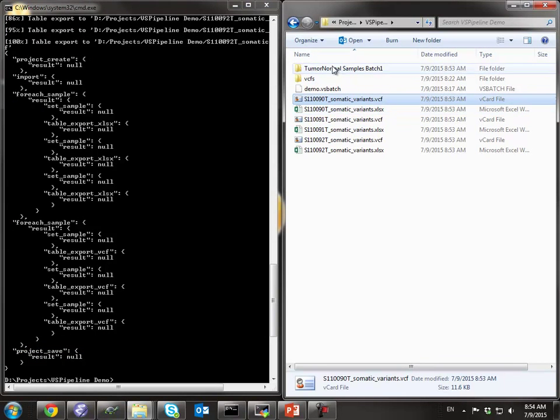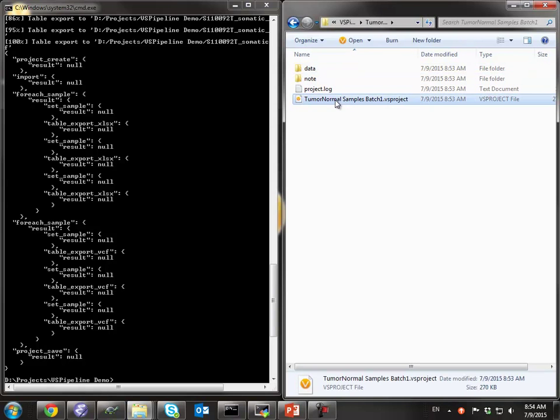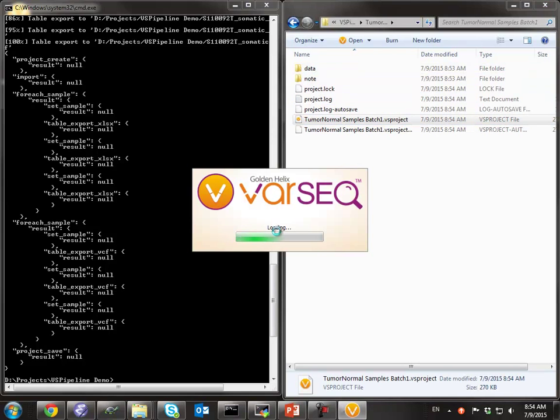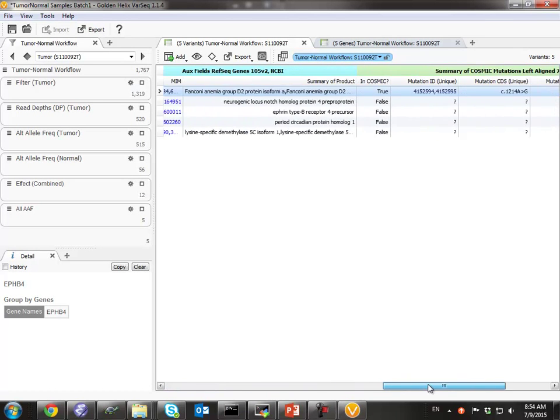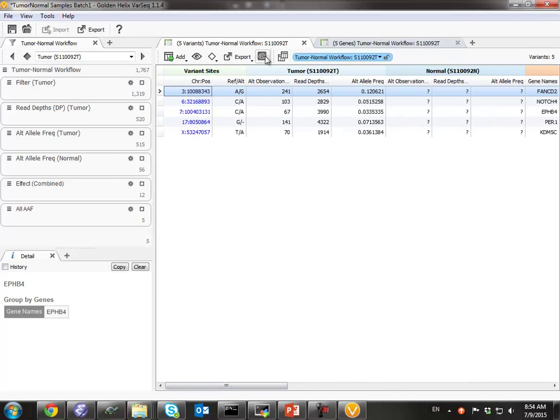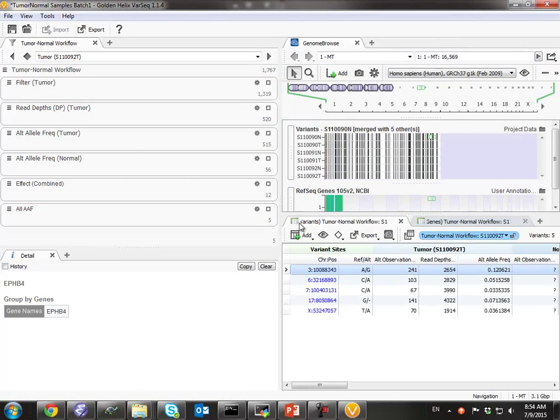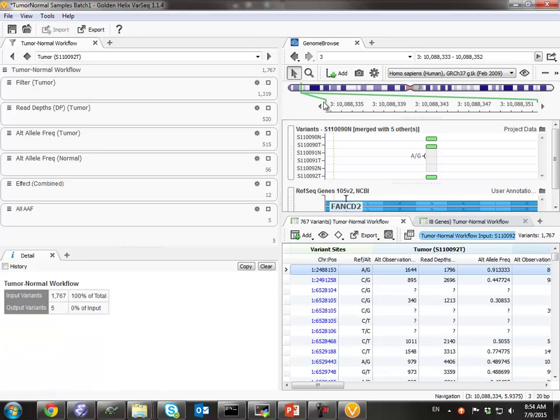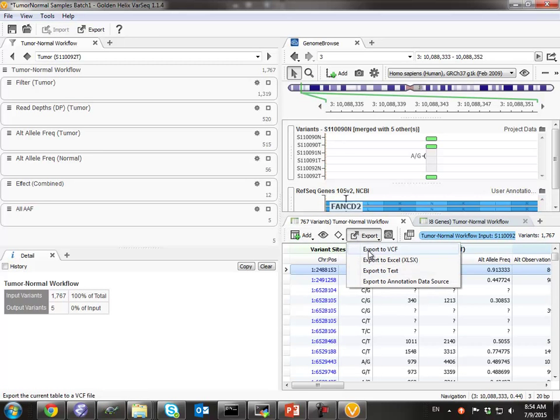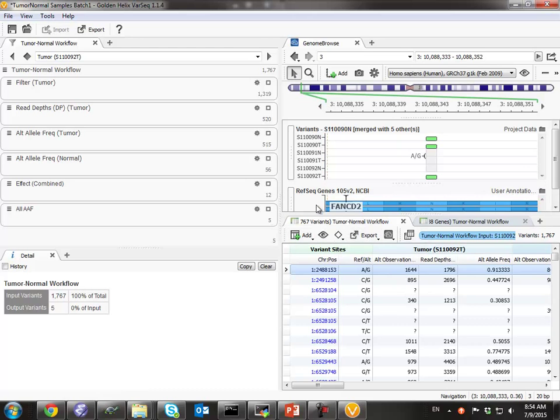We have outputs in VCF file format of the same types of variants, and this is the project that you can send as a deliverable. If I open it up using VarSeq, it just pops open. This project has been fully run, so it immediately loads. These are the same five variants we were looking at in the Excel file. Now we have the interactive project view, where I can add visualizations from Genome Browse, looking at these variants one by one. I could also export a different set of variants, such as this full set of unfiltered variants, run my own exports to Excel — and this is all what's doable inside the VarSeq Viewer.